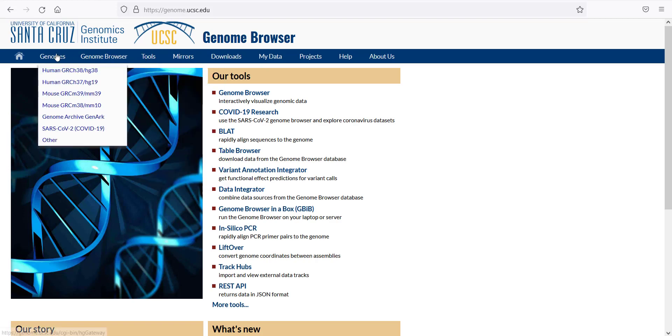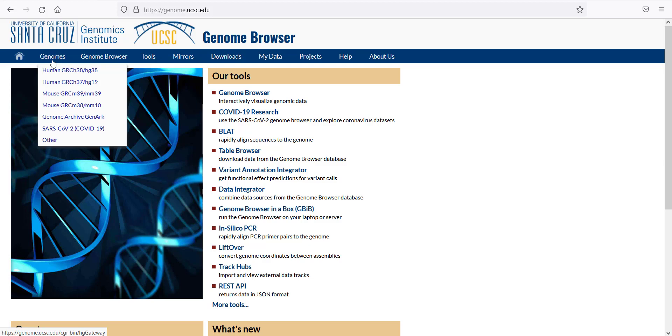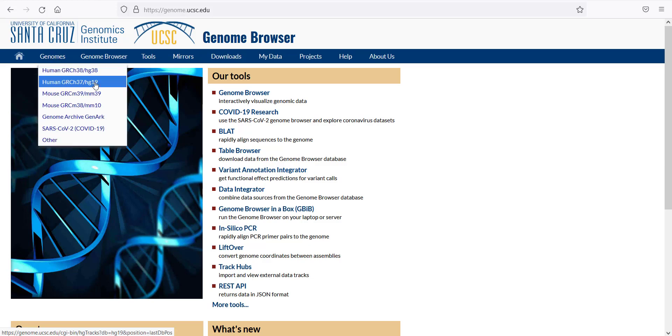To find the genome of interest, hover over Genomes and then click on the version of interest. For example, the human genome, HG19 in this case.